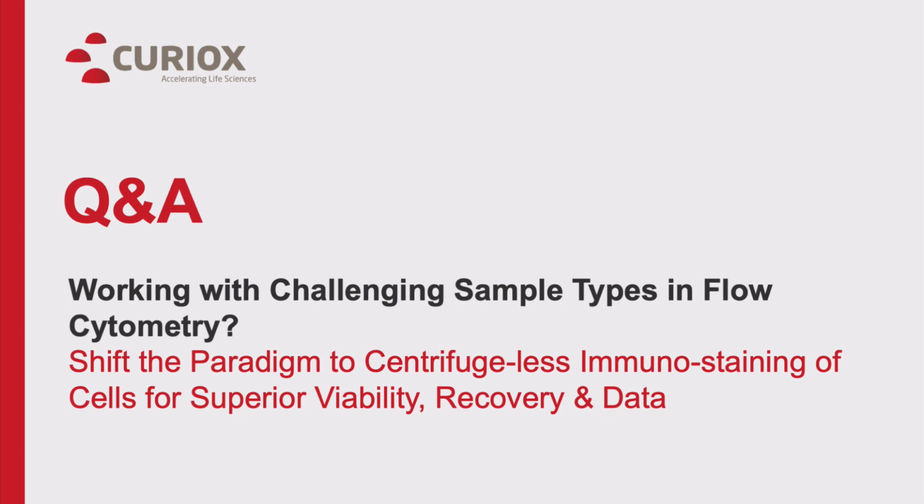What is the minimum time required for cells to settle during incubation time? That's a really good question. So a lot of it's going to depend on the cell type that you're working with and what the density of your cells are. Generally speaking, for PBMCs, which we've done a lot of our work on, it's about 30 minutes. It might be a little bit longer for some other cell types, or if your cell number is a little bit lower. So it's about 30 minutes.